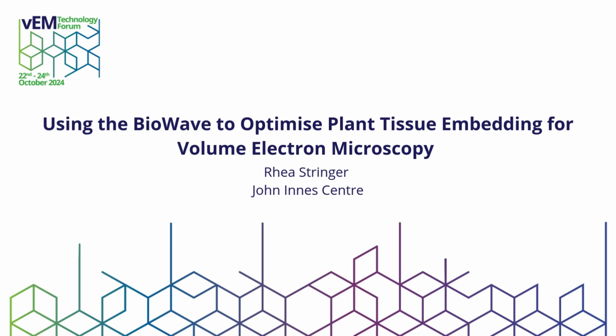Not yet. Primarily in my role at the John Innes Centre, I was brought in to start up volume EM, because it was a new technique that was brought into the platform. So I was told, this is what we're going to do, and here's Durcupan. So I've been having the joys of working with Durcupan. I've heard a lot of good things about Spurr's resin, and we've actually got a Spurr's kit, so that's something I need to work with. I have heard that Spurr's is, despite also being viscous, easier to work with than Durcupan, but that's something I'll definitely explore, and we can have a talk afterwards for sure.